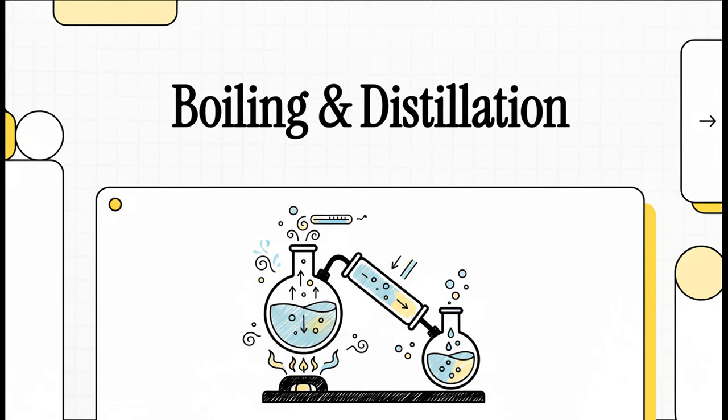Hey there. You know, when you see water boiling for your coffee, you're actually watching this incredible battle of pressures happen right at the molecular level. It's pretty cool. But what if I told you that exact same process is the secret behind a super important lab technique called distillation? It's how we separate and purify all sorts of liquids. So today, we're going to break down both the science of boiling and the magic of distillation.